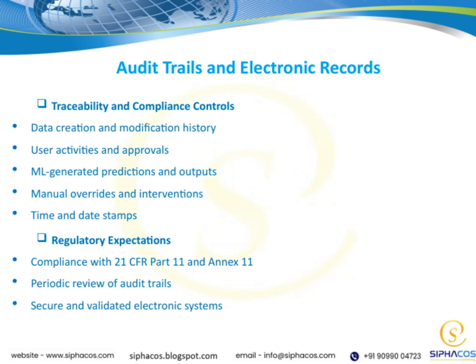It's also critical that our electronic systems are secure and validated. This means they undergo rigorous testing and validation processes to ensure they function correctly and protect the integrity of the data at all times. By adhering to these principles, we not only meet regulatory expectations, but also foster trust in our systems and data management processes.